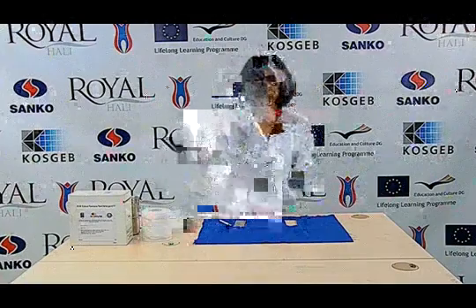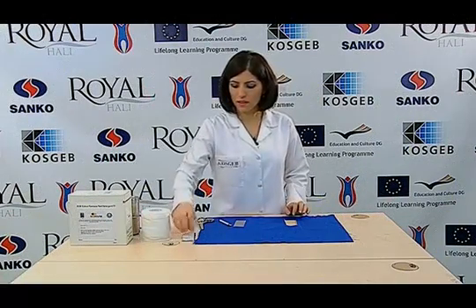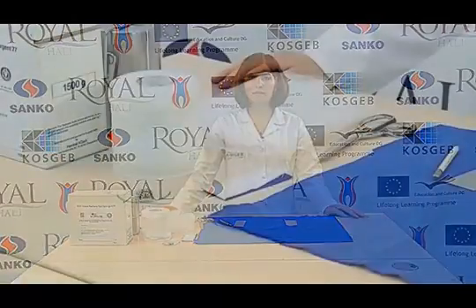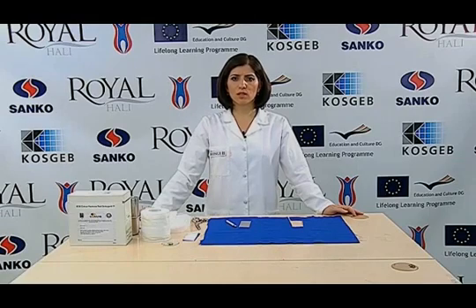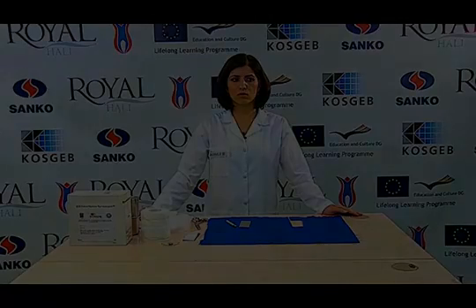The fabric specimen is prepared in this way. If the test sample is made of yarn, the 40 mm by 100 mm yarn is put between the multi-fibre adjacent fabric and the undyeable fabric, and they are sewn along four edges. The sewn test samples are ready for the test.